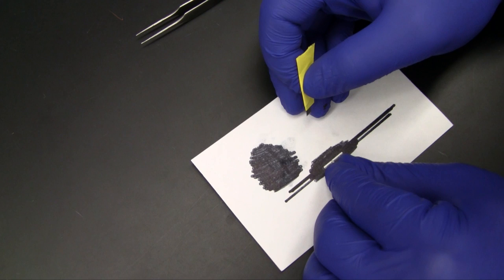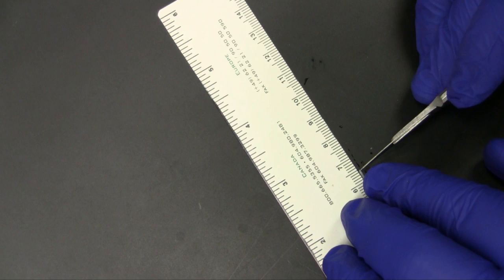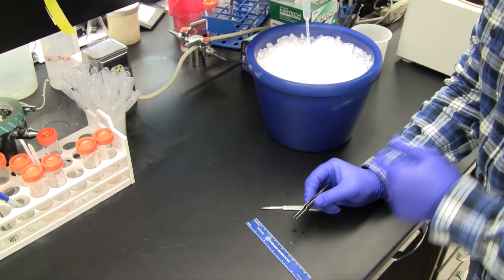0.75 to 1 millimeter of meristem tissue is removed with a sharp blade. All cuts should be made perpendicular to the longitudinal axis of the root. The root can be measured either with a ruler or a prepared template. The root meristem is then transferred into the enzyme solution and the tube placed on ice.